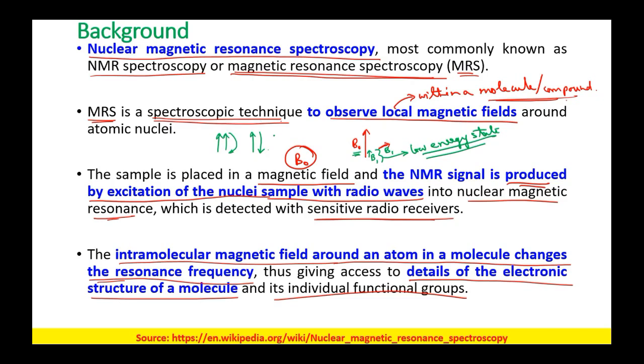That means we are giving some energy to the second magnet so that it can stay in the opposite direction, or in the high energy state. As soon as we remove this energy, what would it do? It would flip back to its low energy state. Are you getting my point?